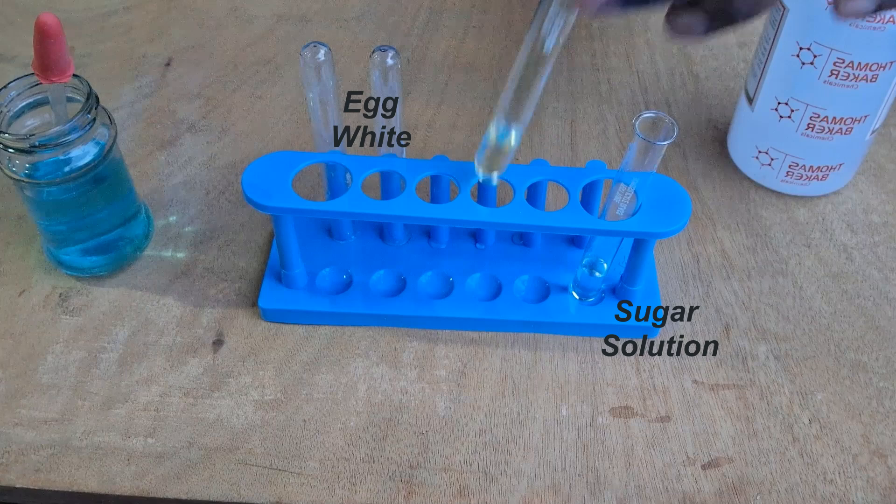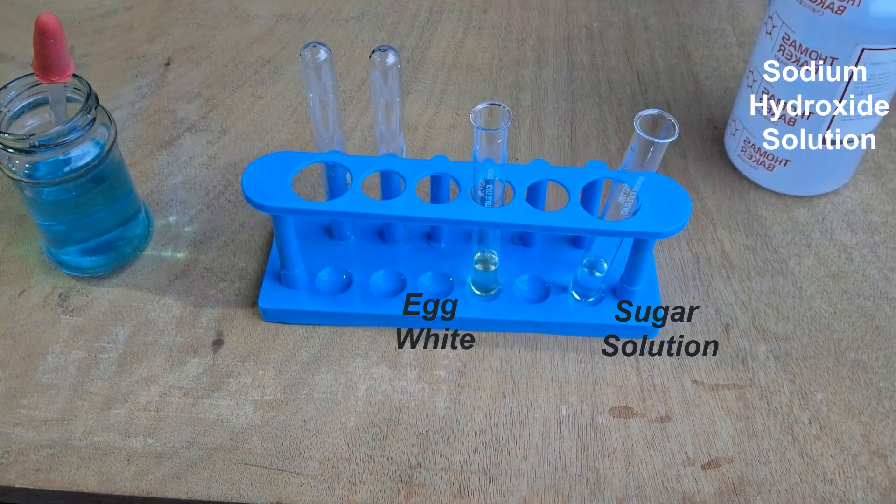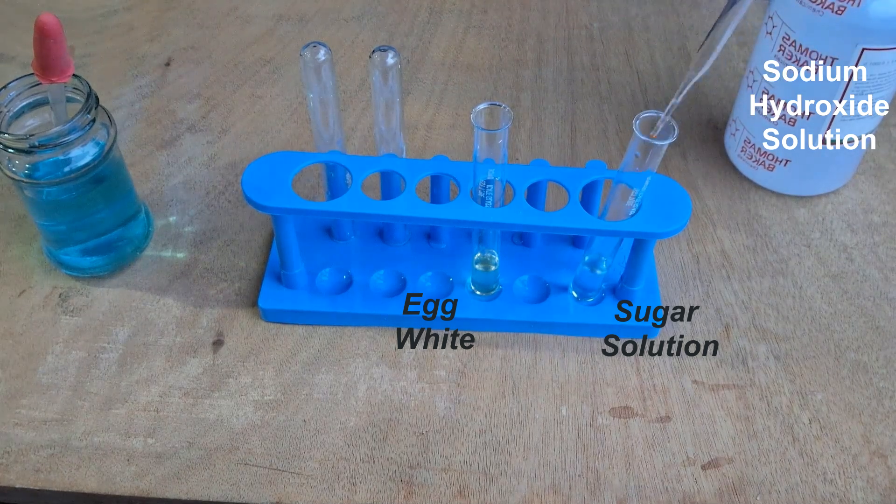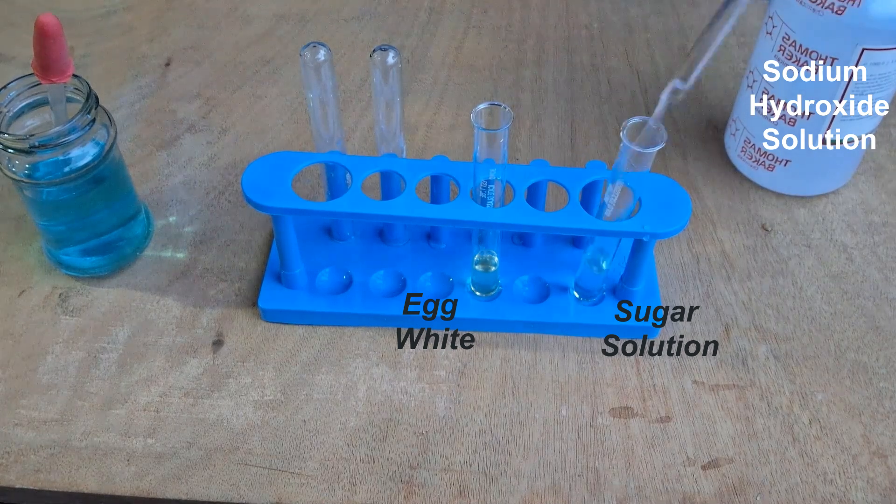That's the egg without the yolk. We take dilute sodium hydroxide solution using a dropper and put a few ml of sodium hydroxide solution in both test tubes.